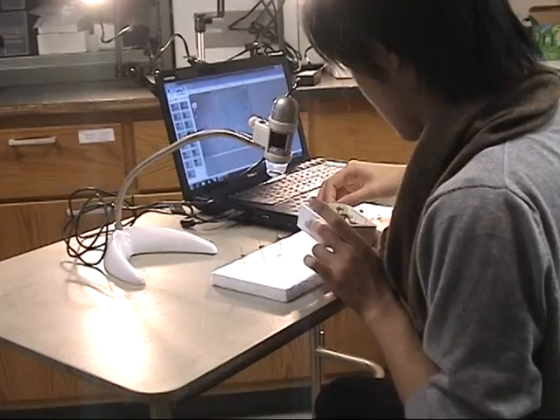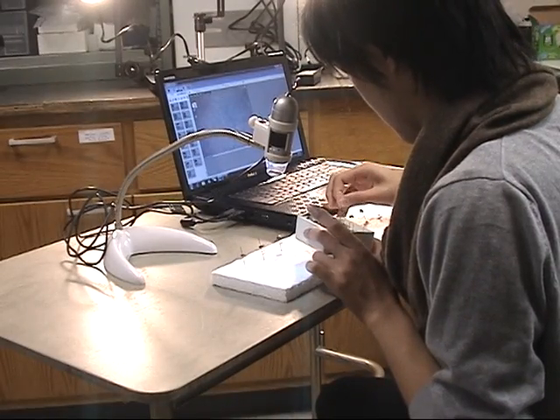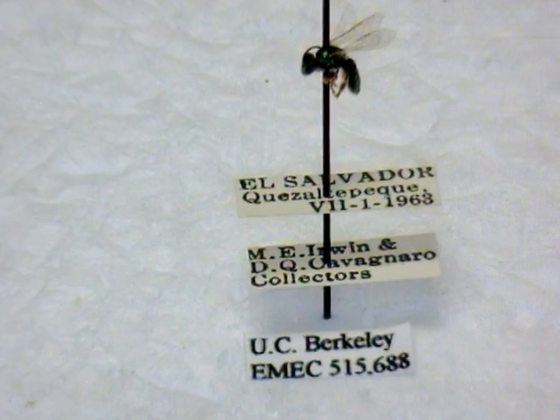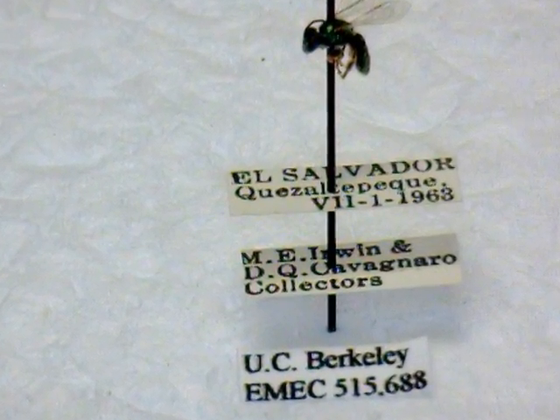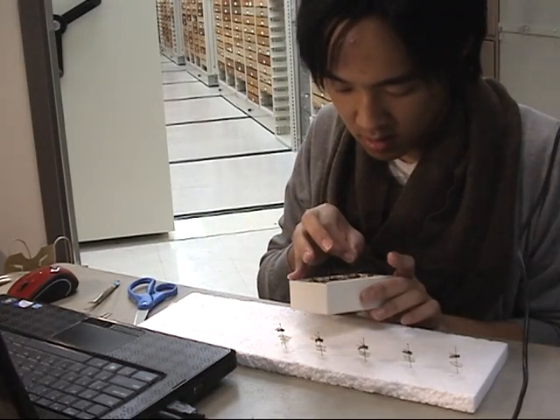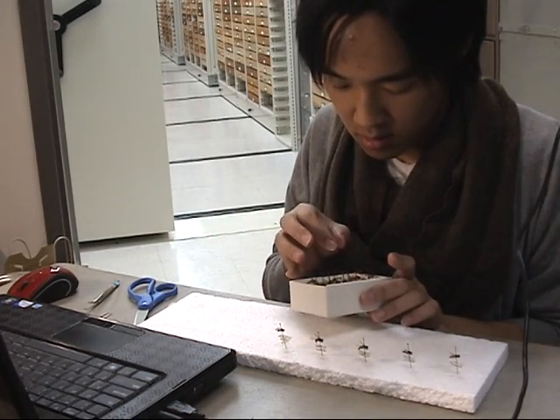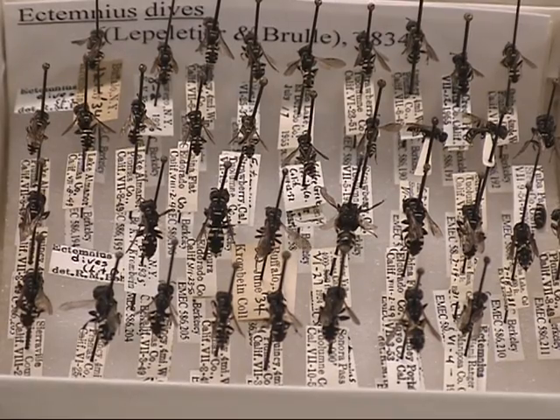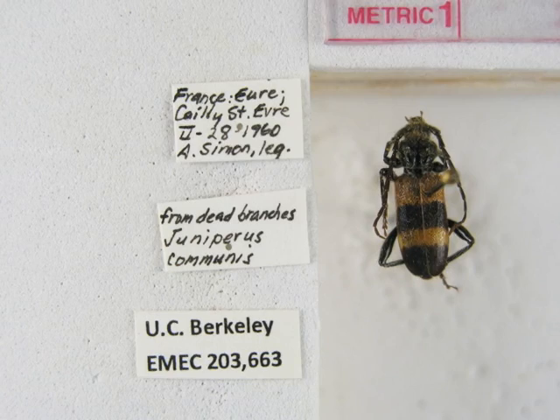The second difficulty involves the preparation of small specimens, which often entails pinning the insect with numerous labels on the same pin. The specimens are fragile and must be handled with the utmost care, while the labels beneath may have four-point font that is difficult to read without a microscope. Many specimens have highly abbreviated handwritten labels that are difficult to interpret.